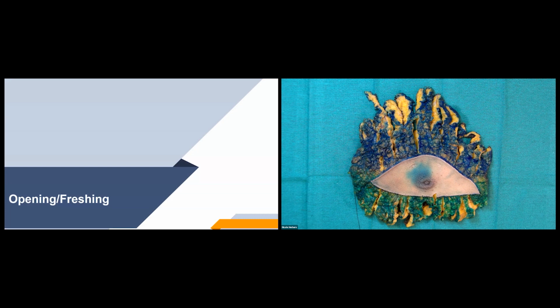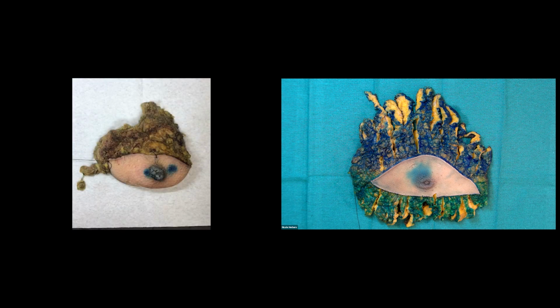So now we're going to go into how to open/fresh these mastectomy specimens. And no matter why they're taken out, we do the exact same procedure for every single one of them. So I've made a few short video clips to demonstrate the different steps that are involved with breast freshing.